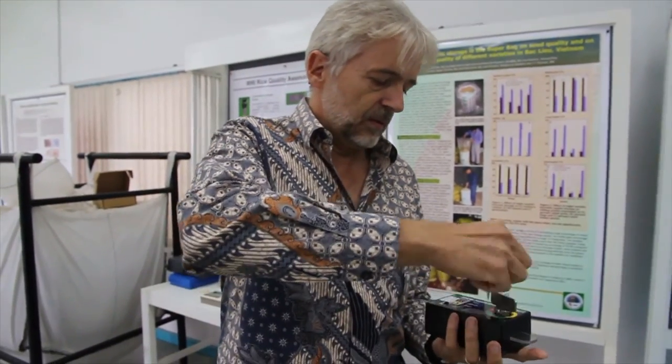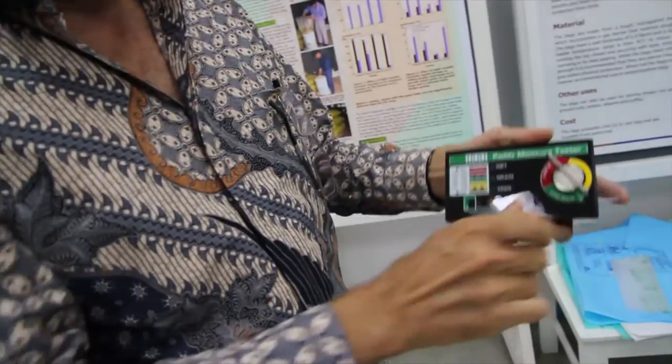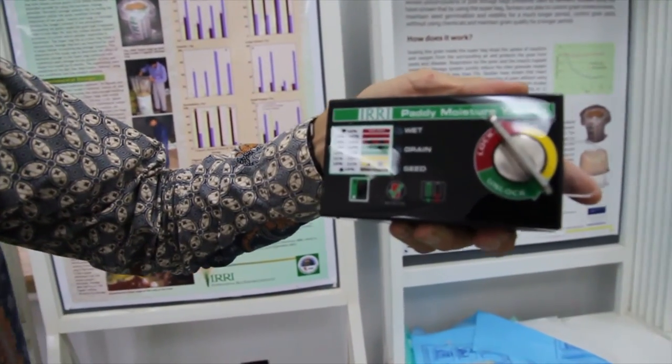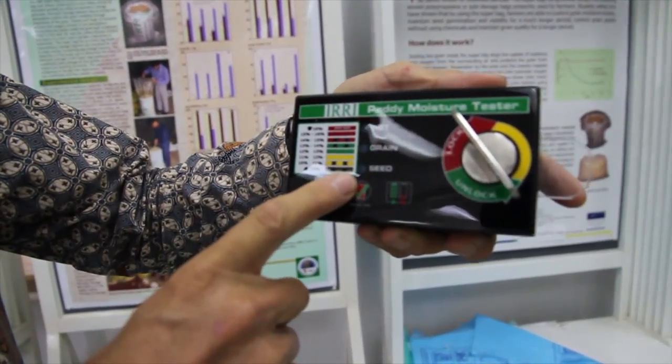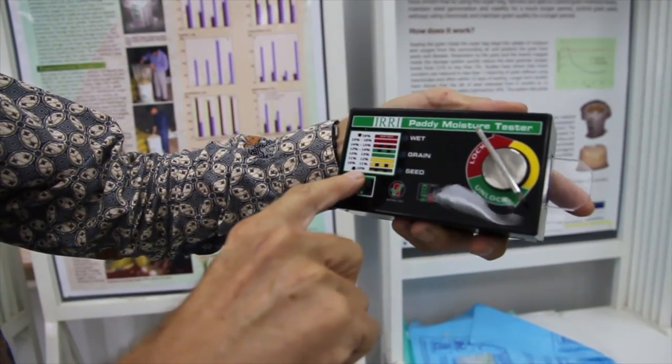Here we have a sample of that seed. We crush it again, and it is so dry that all lamps blink, which basically means that it's below 10% moisture content. So that would be safe for the storage of seed.